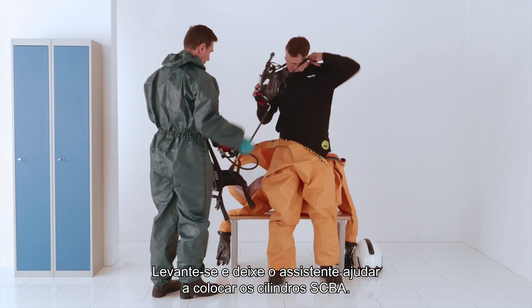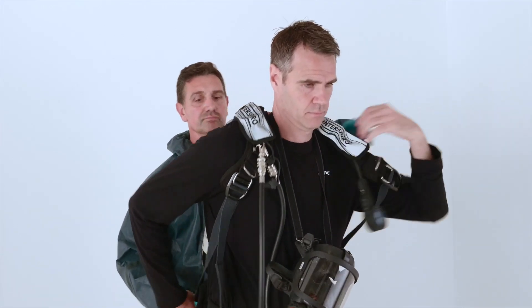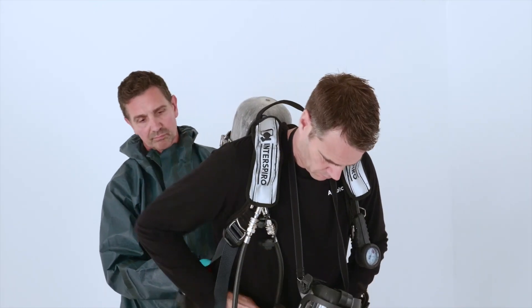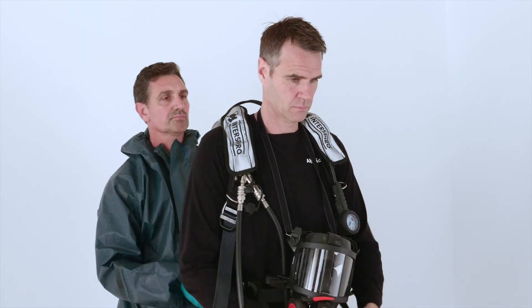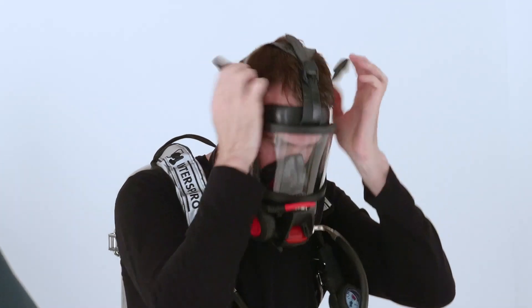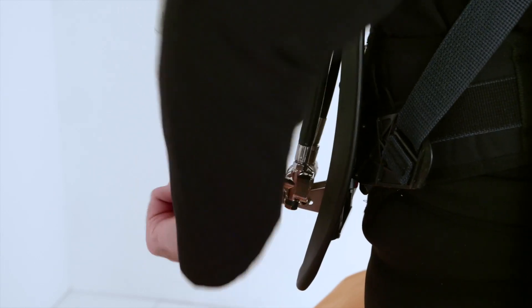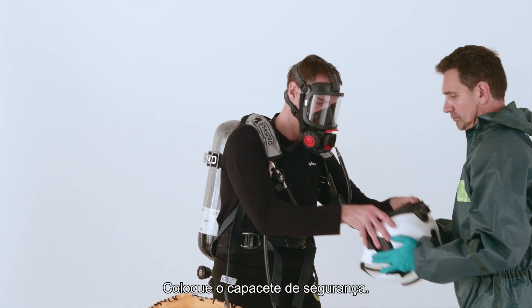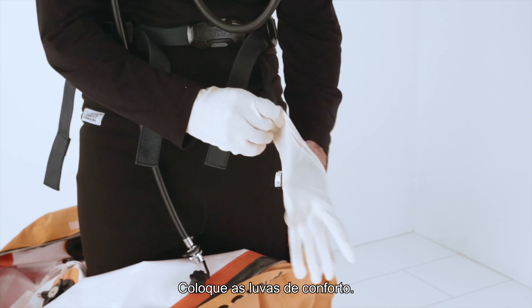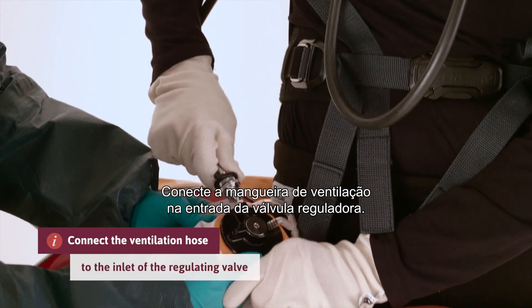Stand up and let the assistant help to put on the SCBA cylinders. Put on the mask. Open the airflow. Put on the safety helmet. Put on the comfort gloves. Connect the ventilation hose to the inlet of the regulating valve.